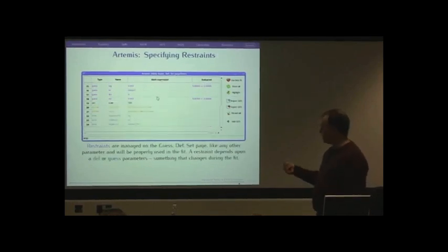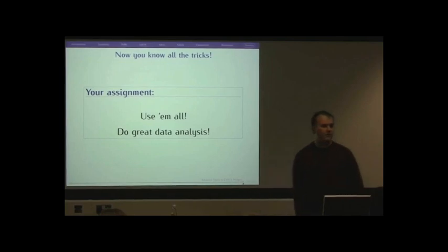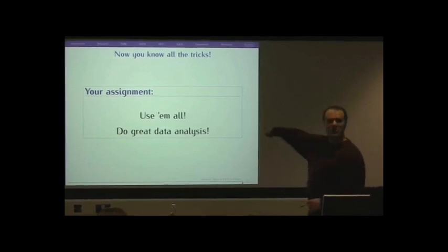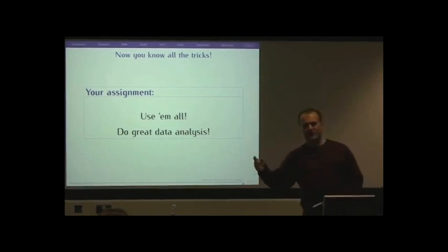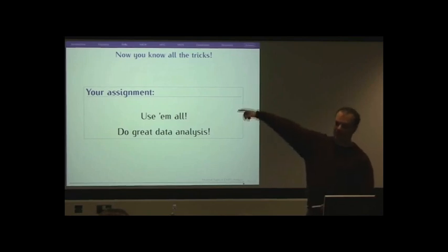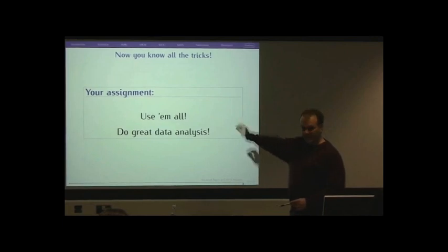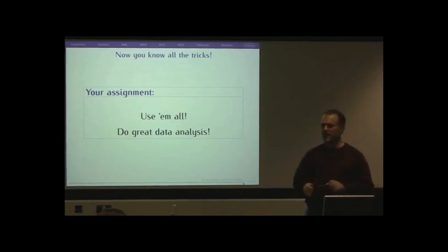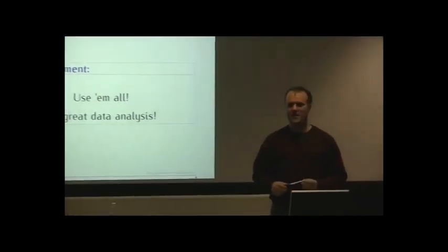And yeah, okay. And now that's all the tricks. So, in principle, you know just about everything I know now. So go do all those things and measure great data. Well, okay, you do that in the opposite order. Go measure great data over at the beamlines over there, and then go do all of those tricks. And then, ideally, I will start getting really excellent papers to review instead of papers that I have to send back for further consideration. So do all that stuff. And that's everything about fitting.